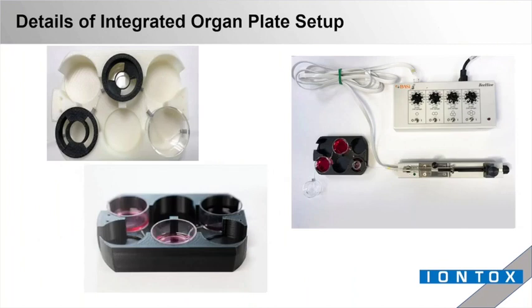our photos here. So what we have here in this syringe is a buffered system. Now this buffered system essentially mimics human blood. As this is on a timer, on a pump, it'll pump the simulated blood through the system. And if you can see here, this portion is non-permeable. In here it's permeable. So anything at about 30,000 Daltons or less is essentially diffusible into this simulated blood flow.